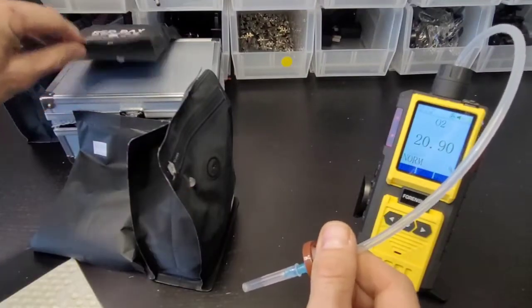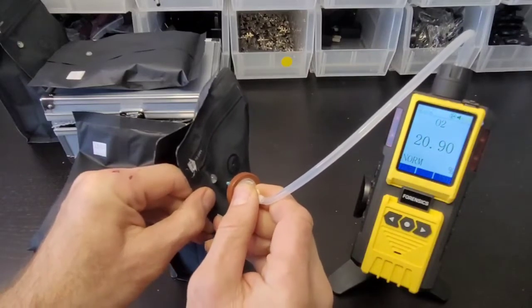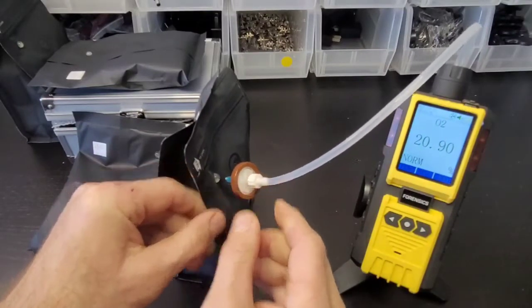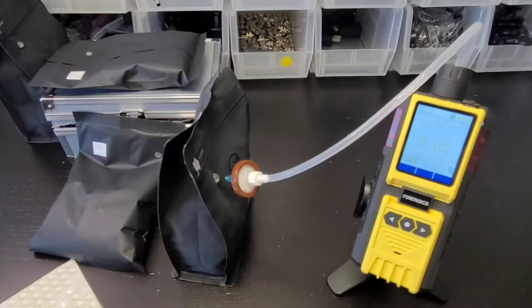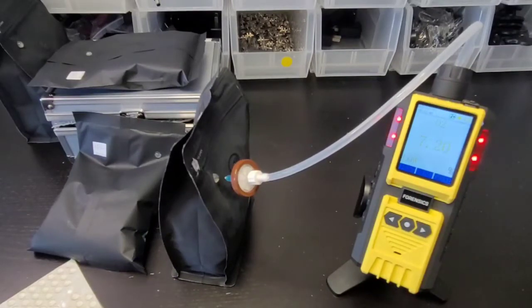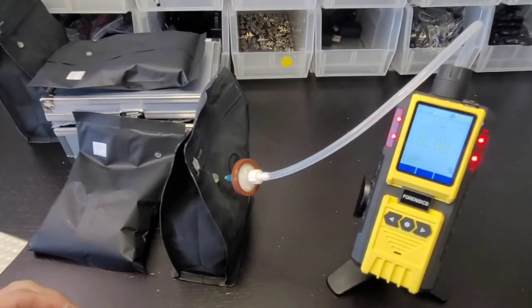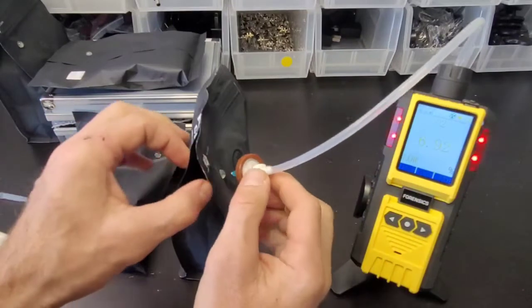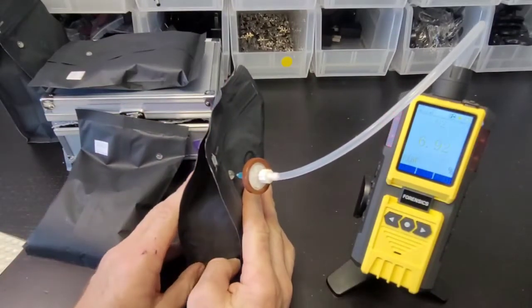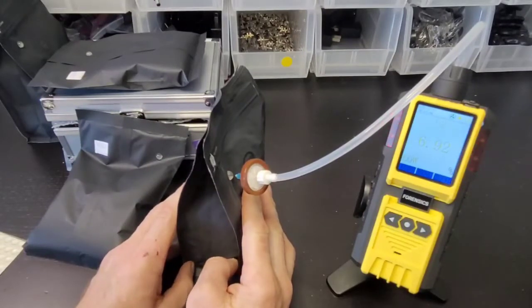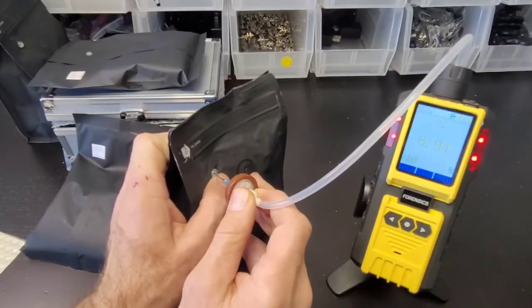Let's do this second package. It's going down, less than 8%, so it looks like a lower concentration of oxygen. 6.92 is the lowest. We can pop that out. As you can see, it takes less than 30 seconds.